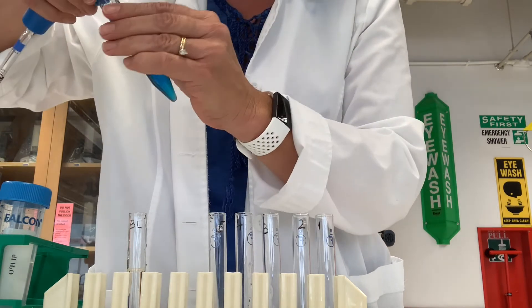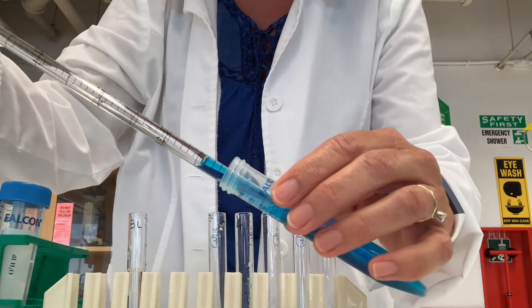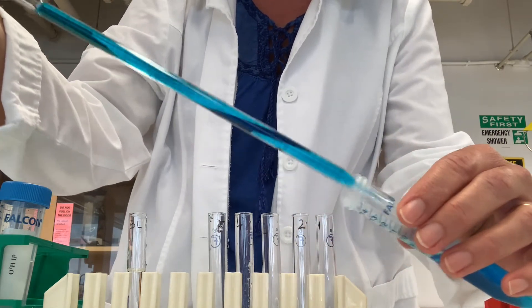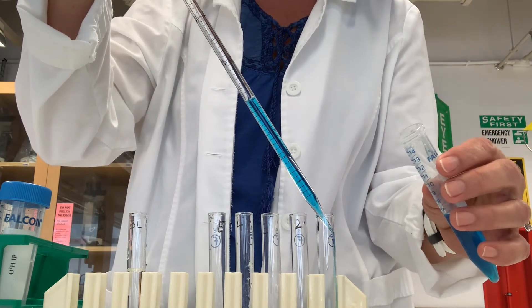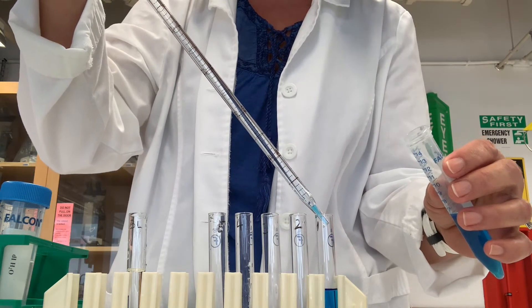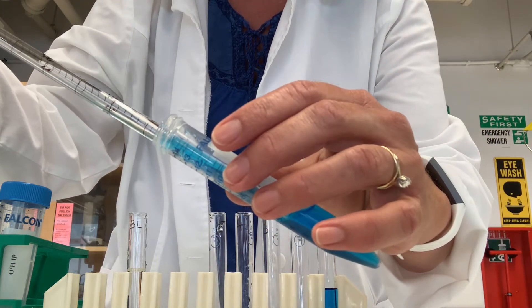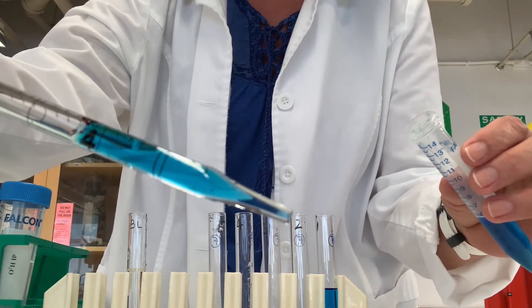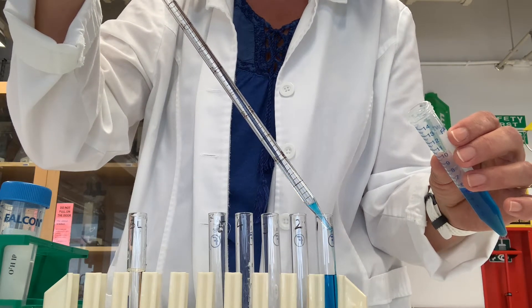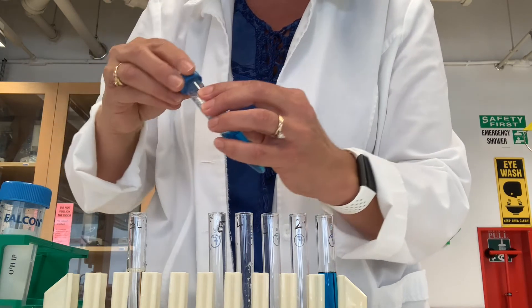We're going to start by putting six milliliters of methylene blue dye into tube one. I pipette five milliliters by filling the pipette all the way to the zero mark and delivering everything into tube one. There's a little bit left in the tip, so I depress the button on top to blow everything out. Then I add one more milliliter to the four milliliter mark to reach six milliliters total. I can set my pipette aside and cap the stock solution, as I won't need it anymore.